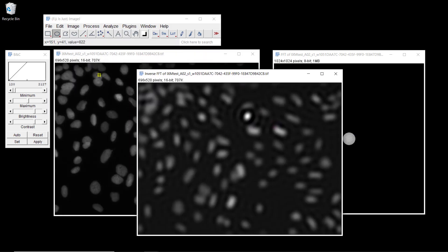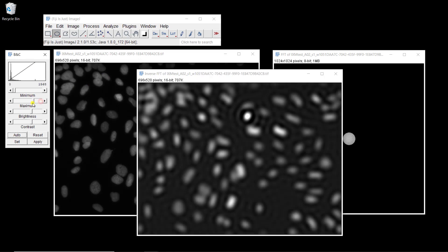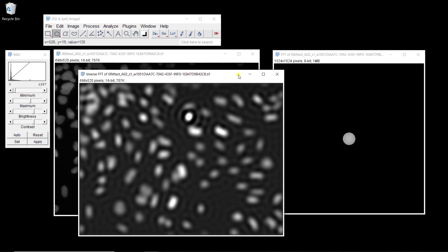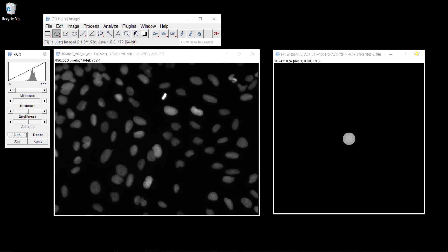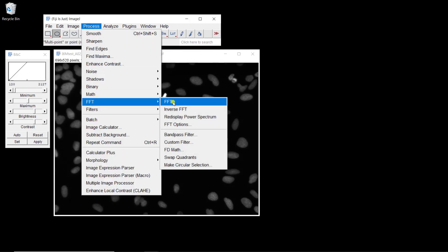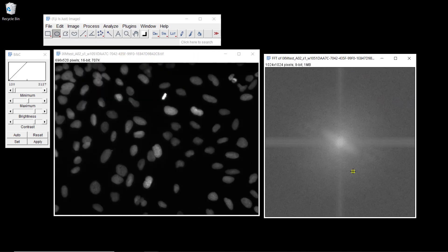As you can see, that's different from the original image. What we have are really regions where the intensity is flat — it actually corresponds to the low frequencies of this image, the part of your image that is not changing a lot. Now we can look at the high frequencies. So let's compute again the Fourier transform of this image, and now instead of considering what is in the center, we're going to consider what is outside the center.